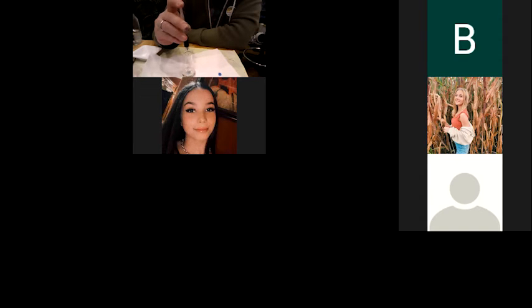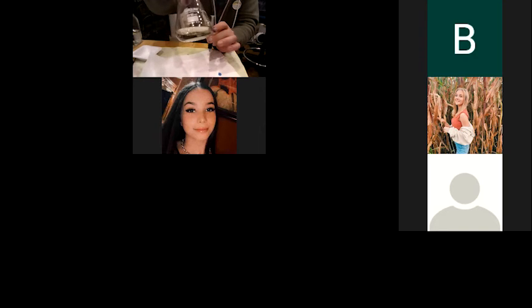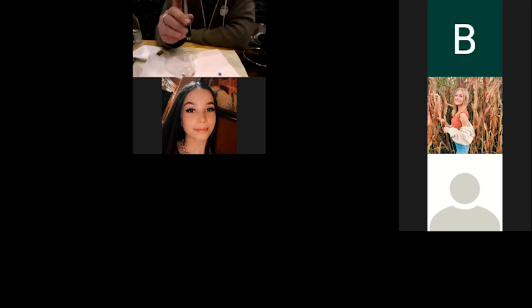I can also see a little bit of yellow. It probably won't show up on the camera, but you can see a little bit of yellow in there from the vitamin C. So I'm thinking this might turn green. Yeah, it's kind of hard to see, but it's a little bit yellow. So I think we may get a green color rather than a blue color. And remember, this is the highest amount of the vitamin C, so it probably will be slightly yellow.